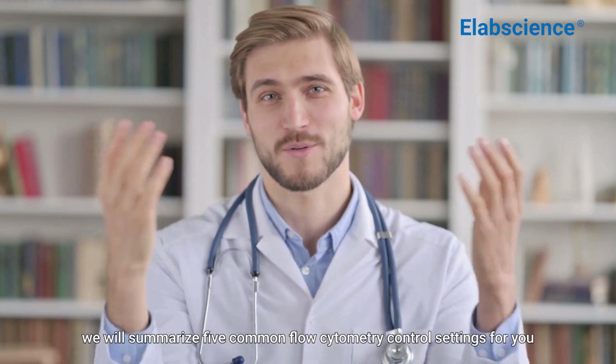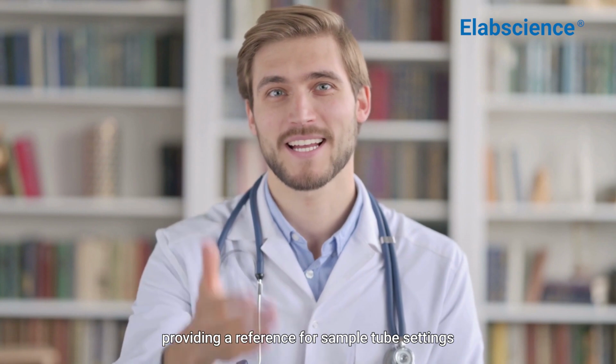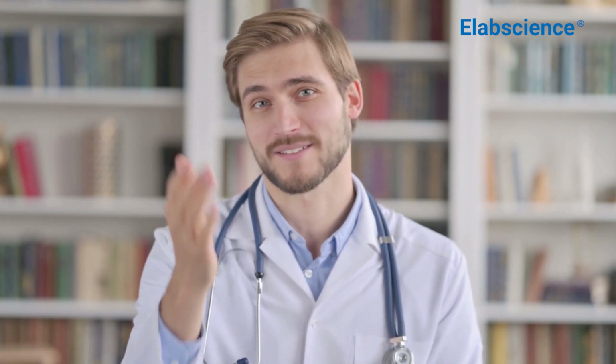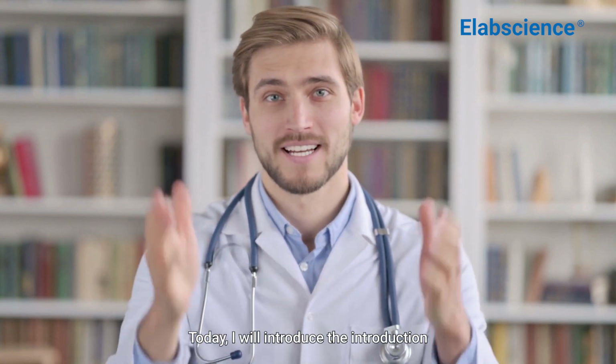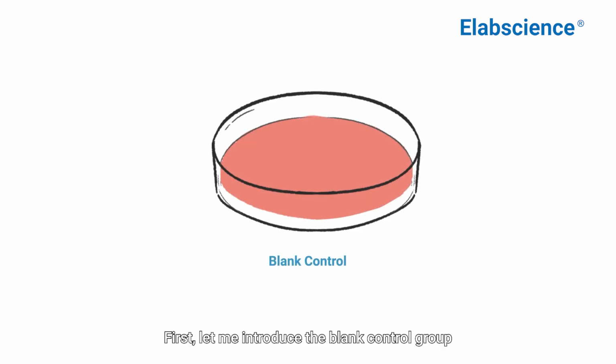In these videos, we will summarize 5 common flow cytometry control settings for you, providing a reference for sample tube settings. Today, I will introduce the introduction and functions of blank control and single positive control. First, let me introduce the blank control group.